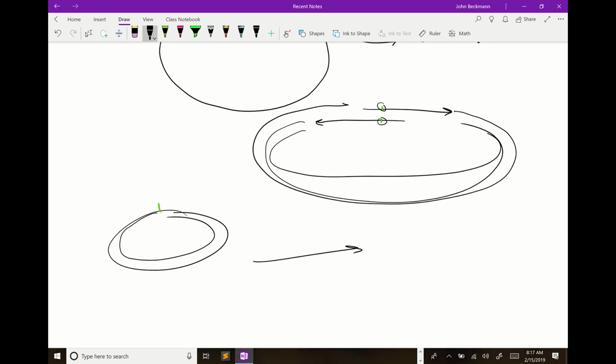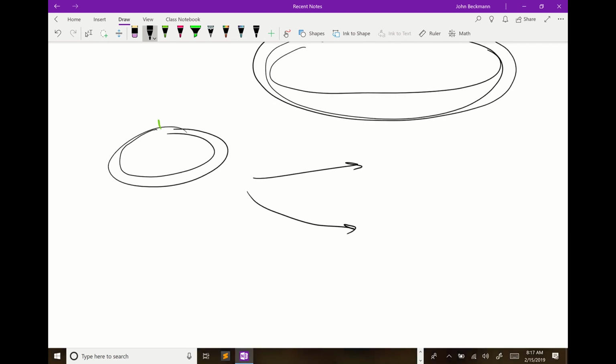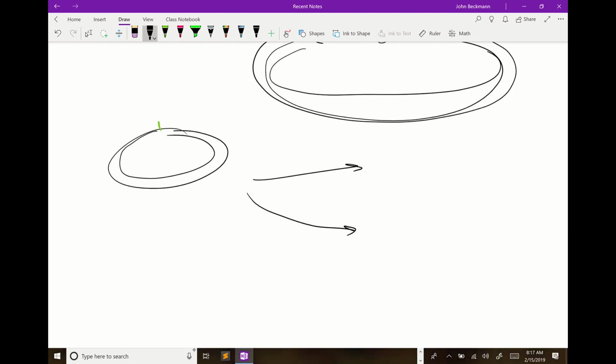And then the next step, you already should be able to kind of know from SLIM, the next step is we have to figure out a way to select for that mutant version against the template. And how do we do that?